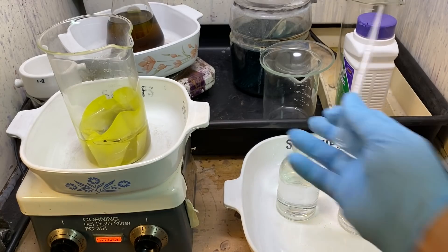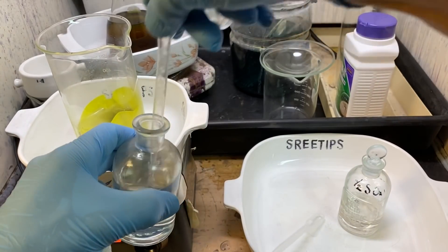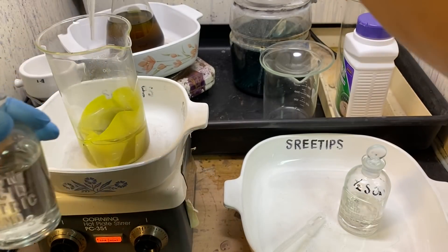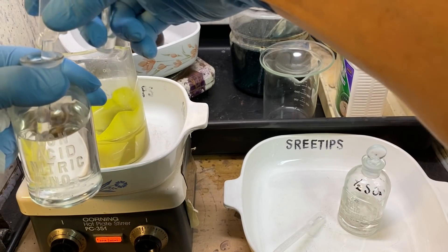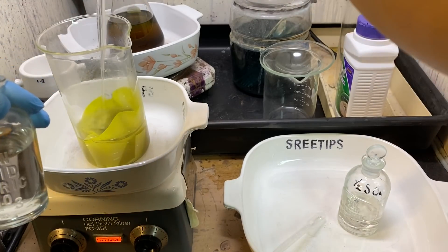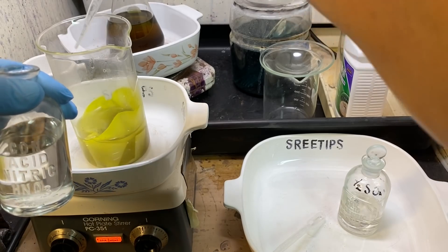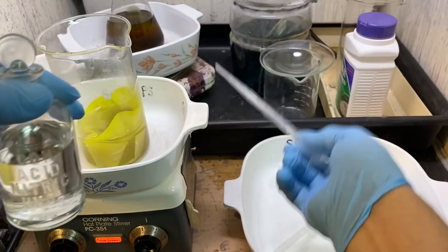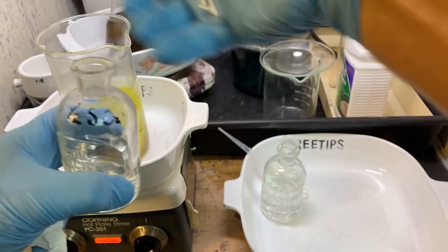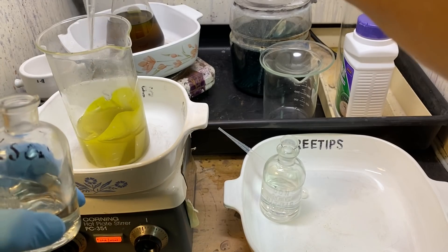We mustn't forget the sulfuric acid. I'll put a couple of droppers of concentrated nitric into the beaker now to form aqua regia in here. I'm going to add some sulfuric — just in case there's any lead in here, this sulfuric acid will precipitate out the lead as lead sulfate, and then we can filter it out later on.